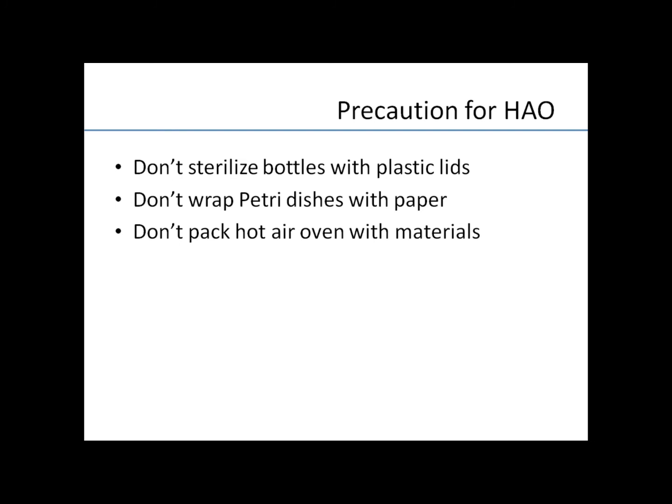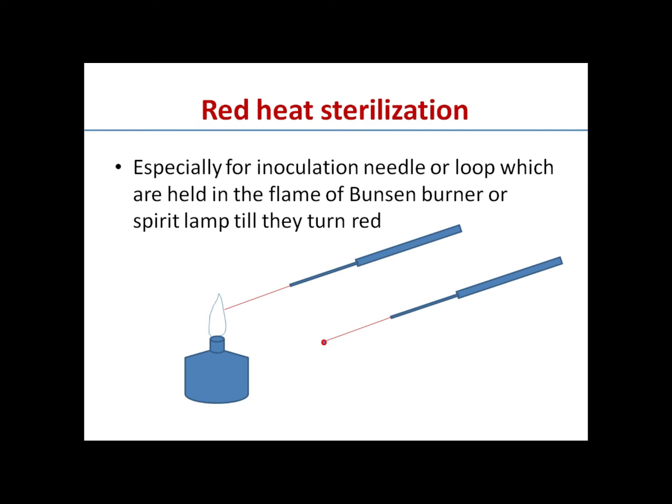And after the materials are sterilized in the hot air oven, we should not open the hot air oven immediately. We should allow it to cool down to room temperature, and then you can open the hot air oven. Next is red heat sterilization.